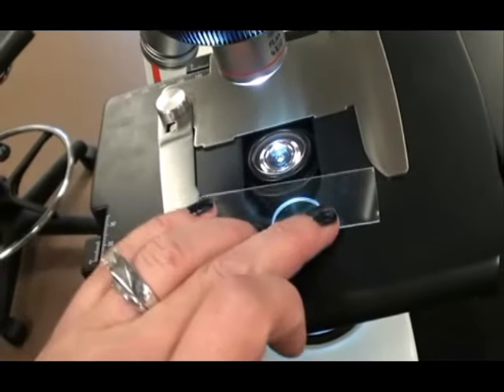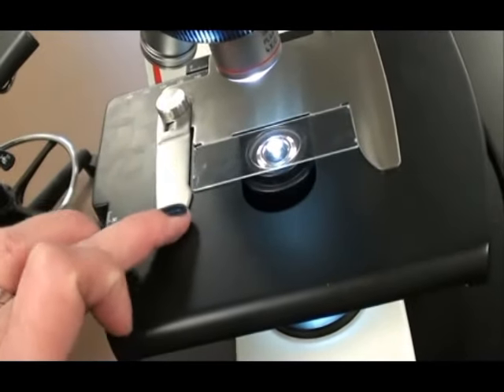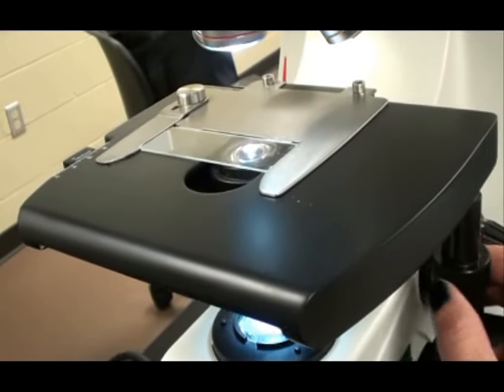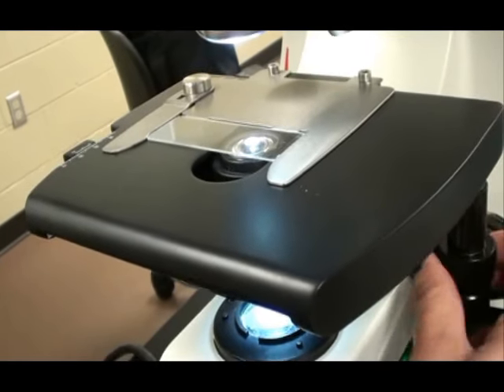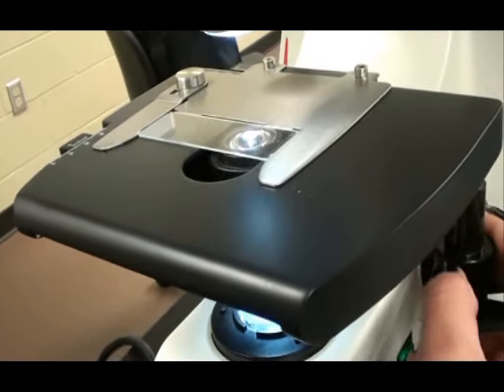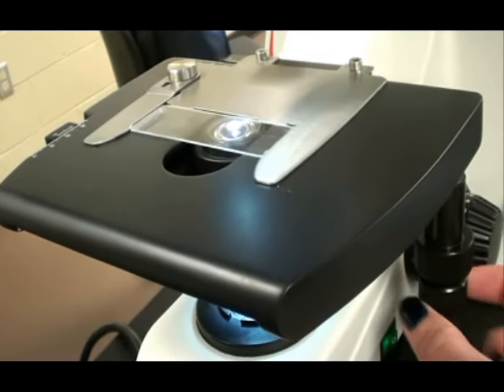A mechanical stage is a very handy feature to have on your scope. You can place your slide into the slide holder and then adjust the position of your slide using the coaxial adjustment knobs, usually hanging off the side of the stage. This way you can center your specimen very easily.